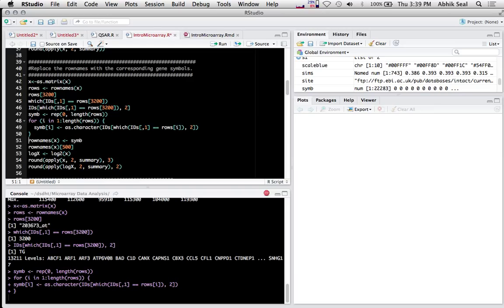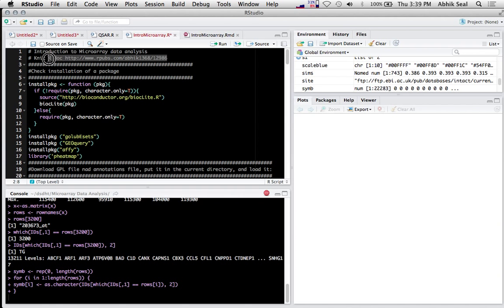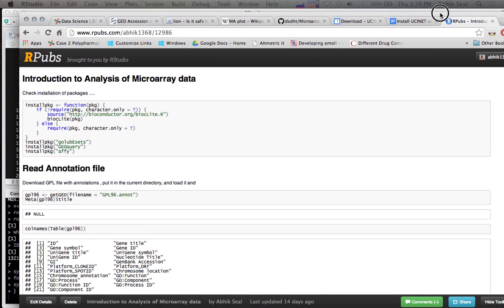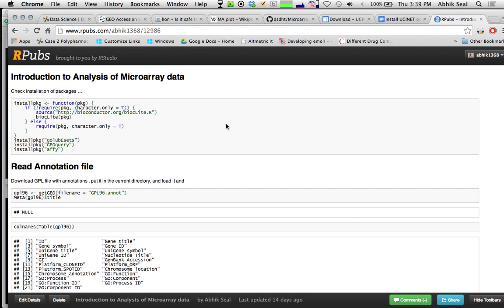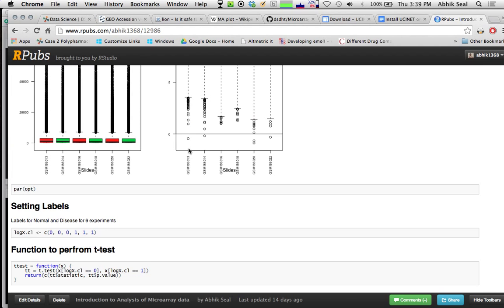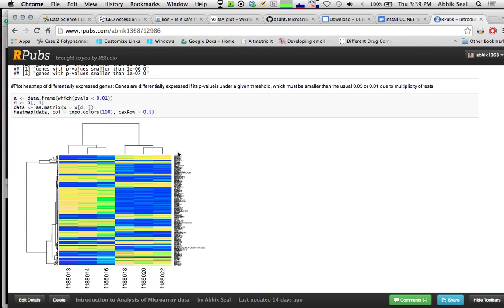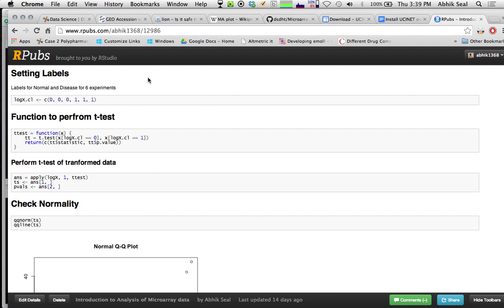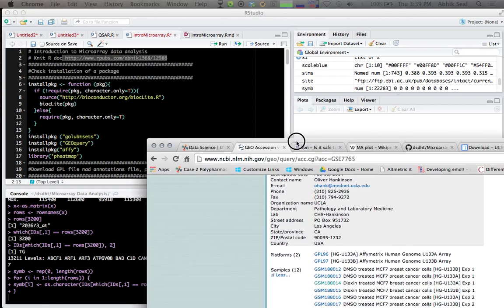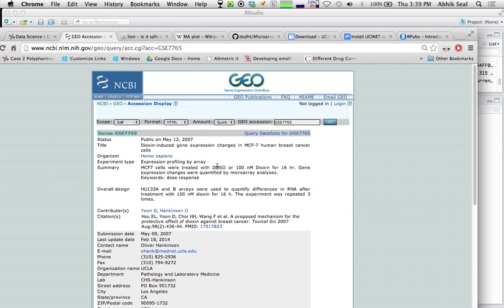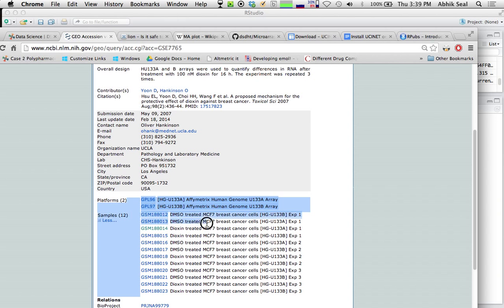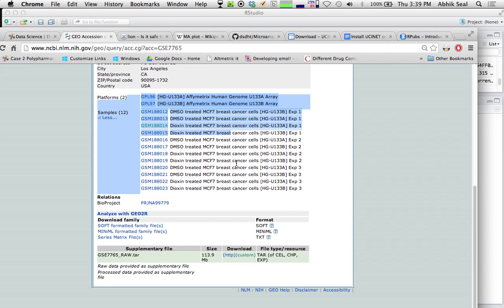Meanwhile, I'll show you the RPUB website where you can get the whole analysis of differential expression. The GEO file is located here where you'll see 12 samples. They've mentioned which are DMSO-treated controls and which are dioxin-treated. You'll also find this soft file which has the annotation.